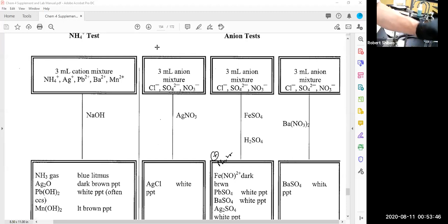Okay, now the second and third wash I'm going to do into waste. And the reason is I need to make sure these are very clean crystals because we're going to test it with sodium hydroxide next. So I got the white precipitate. Okay, that's my second and third wash there. Let it go. I'm going to turn off the bath since I don't have time to analyze another one. One thing you don't want to do is let the hot water bath boil to dryness. If you let it boil to dryness, then that's going to cause problems.